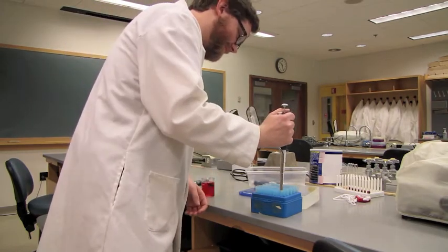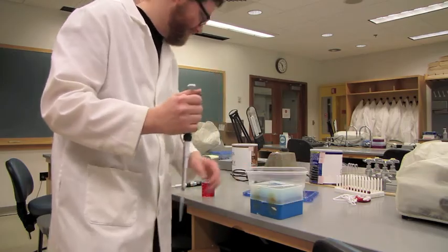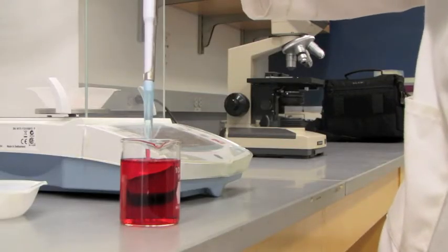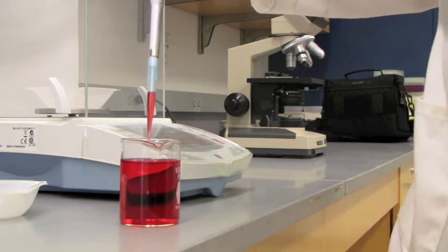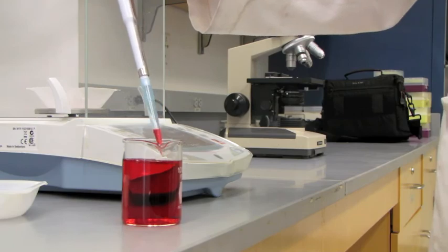With the correct tip size, push down firmly to make sure the tip doesn't fall off during pipetting. With the plunger down to the first stop, bring it up slowly to draw up the desired volume of liquid. Letting the plunger come up too quickly will result in poor pipetting.